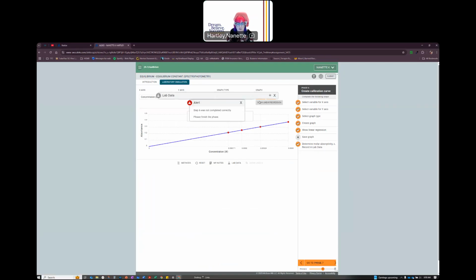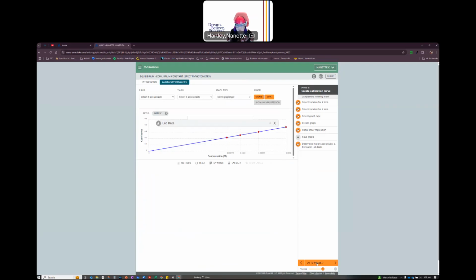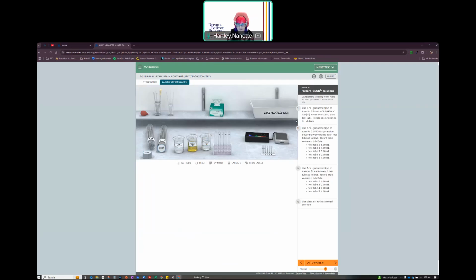Oh, I didn't save it. Oops. Okay. All right. 5 mil. Transfer 5 mils of 0.004 molar into each test tube.